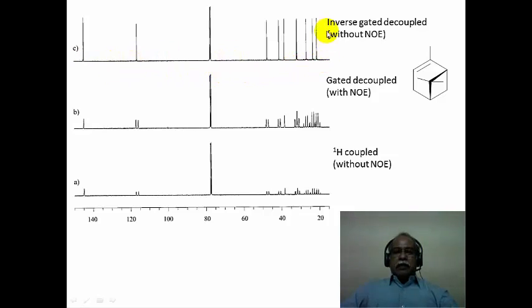In fact, this is a spectroscopic method that one can use to quantify the carbon-13 spectrum. Otherwise, quantifying the carbon-13 spectrum is not easy because of the differential spin relaxation times as well as the differential NOEs of the various types of carbon in an organic compound.